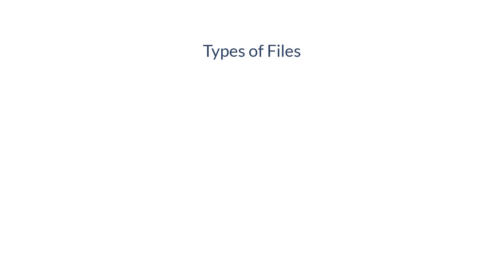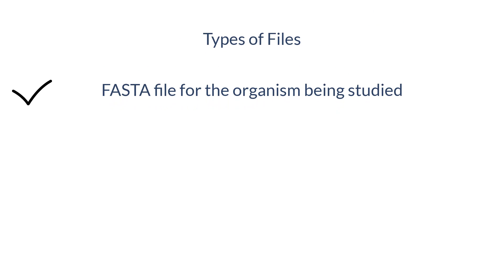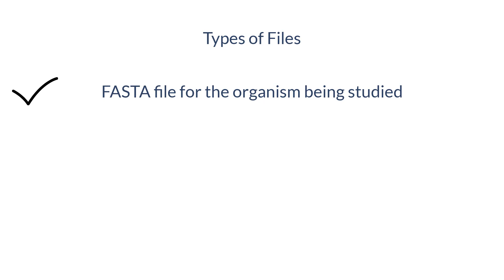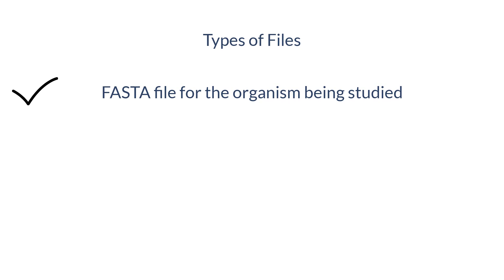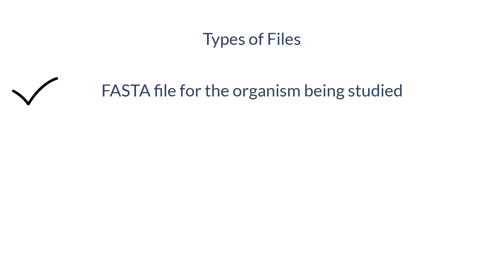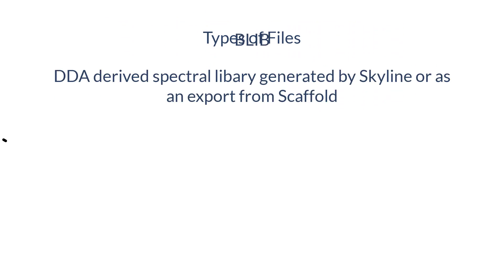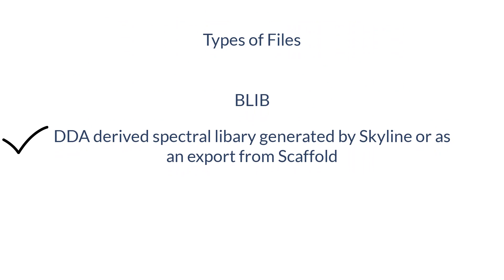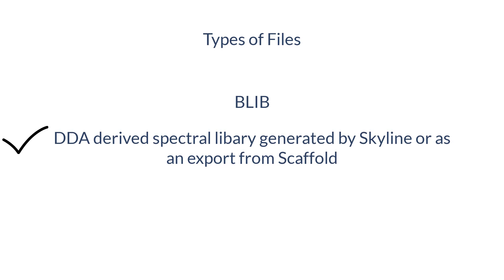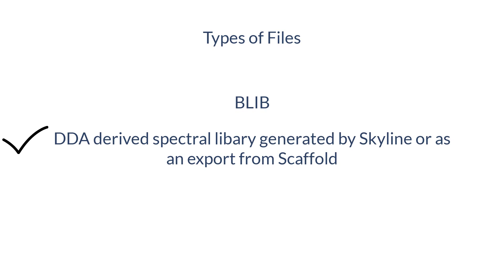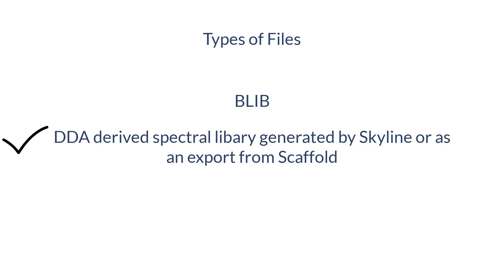There are three types of files that can be used for searching in Scaffold DIA. The first is a standard FASTA file matching the organism being studied. Next is a Blib spectral library that can be created in Skyline or as an export from Scaffold.